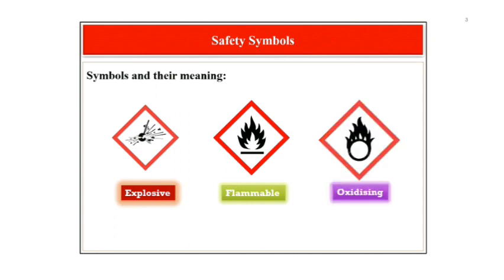The next symbol is the symbol for oxidizing materials. This symbol includes a flame over a circle. It indicates the presence of chemicals that readily give off oxygen or other oxidizing substances. Oxidizing materials may intensify fires, cause explosion, and may be toxic or corrosive. Some common oxidizing liquids and solids are bromine, chlorate, nitrate, perchloric acids and peroxides.